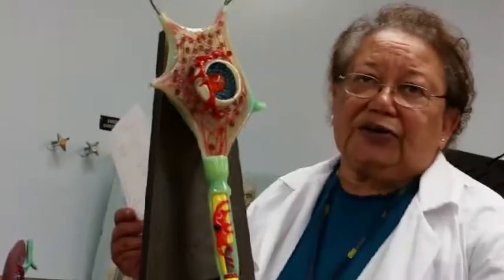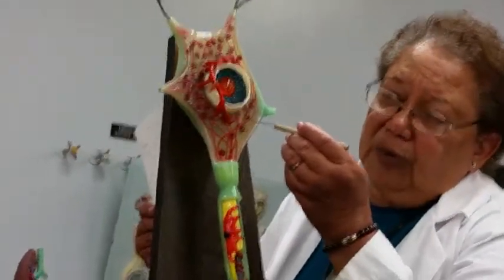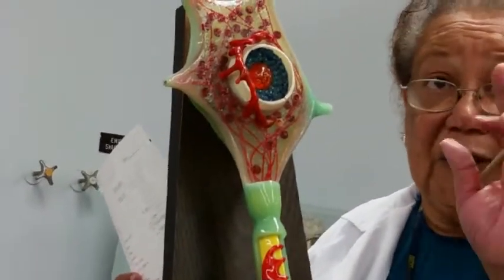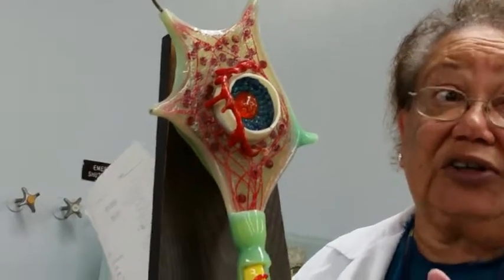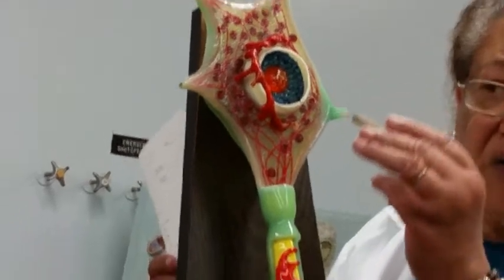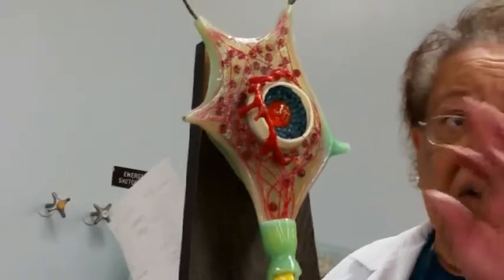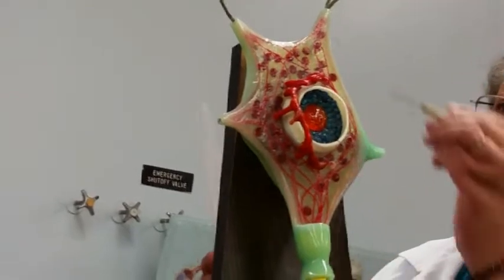And this, of course, on the outside represents the endoplasmic reticulum. Now, these round balls, those are modified rough endoplasmic reticulum called the Nissl bodies, and you had it on your test today. So these round balls, modified rough endoplasmic reticulum, are called the Nissl bodies. I'm not adding it on your checklist. I'm just going with the items on here. So the cell body.